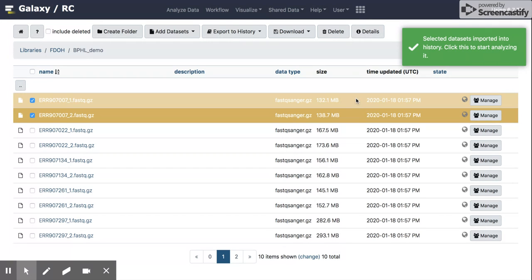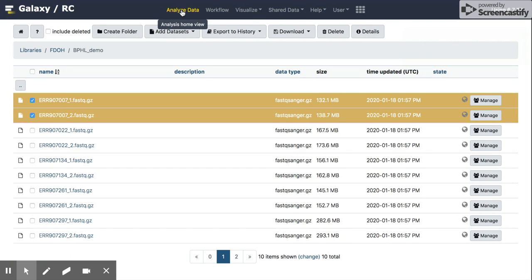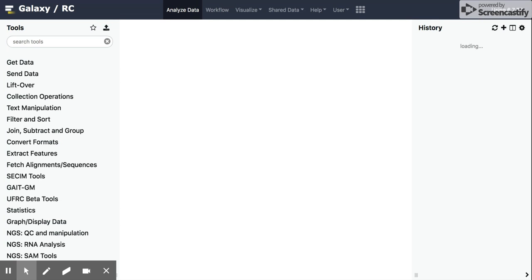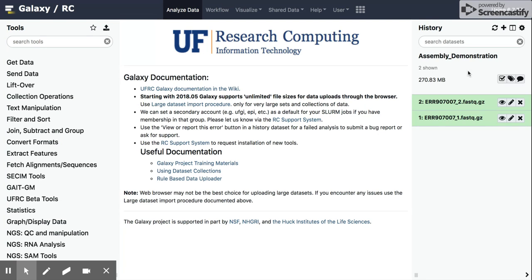All right. Now we can go back to our Analyze data tab after we see that those selected data sets have been added. And you should see them in the history right here.